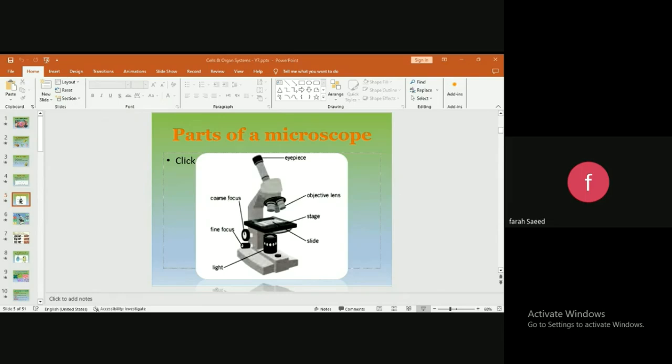This is the arm of the microscope. It supports and connects the eyepiece lens to the base, and you can use it to carry the microscope. We carry it from the arm.